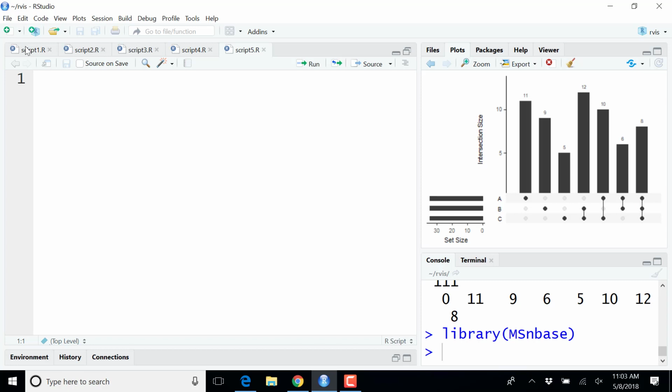And this is the first cluster, and very often we represent this clustering as a tree or a dendrogram. So 3 and 5 here form a first cluster. There is now a new cluster, 3 and 5, that is positioned somewhere here.